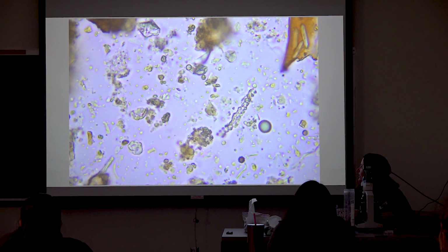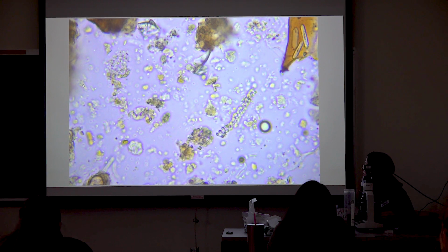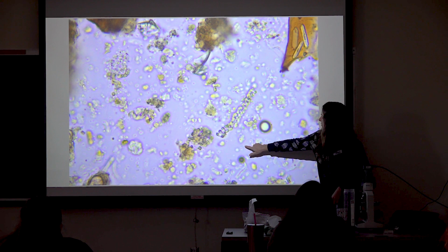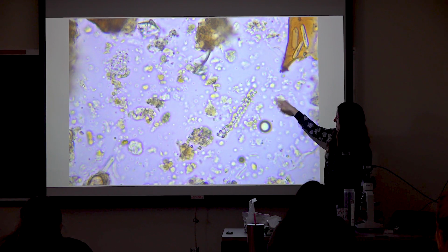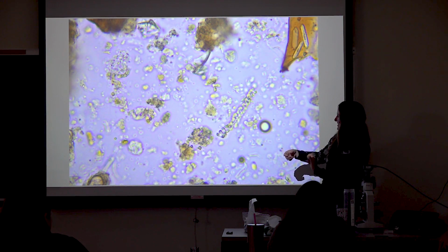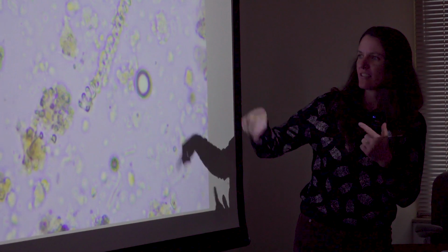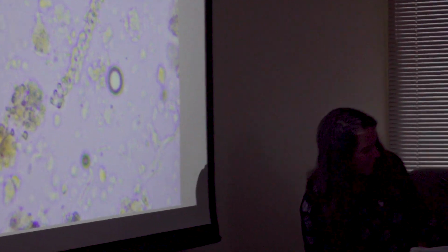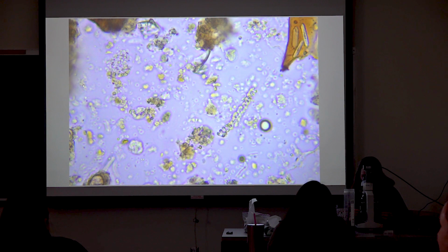So this is actually much too large to be a bacteria. Remember, all of these little guys floating around, the little white ones that you see, those are going to be our bacteria. This is a piece of cellulose. The way the different units that make up cellulose form is they create these super tight spirals, and that material doesn't break down super easy, so often you see it left over in your compost.